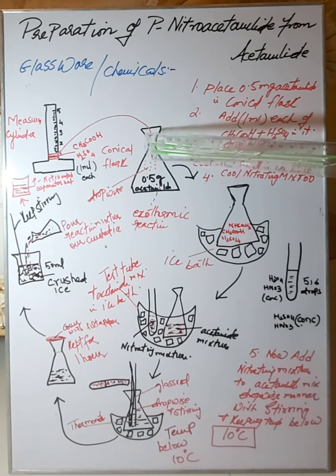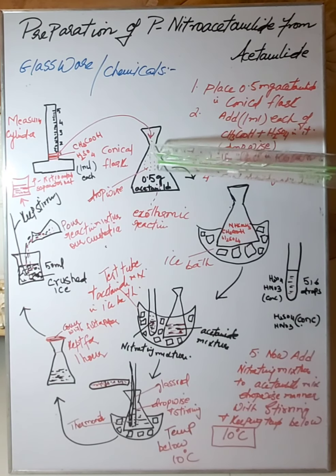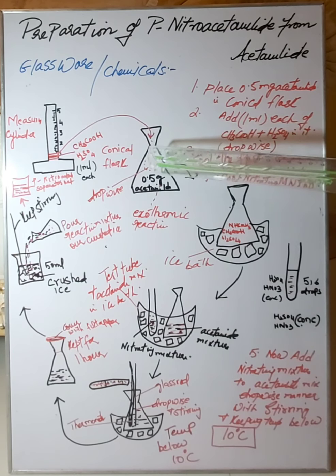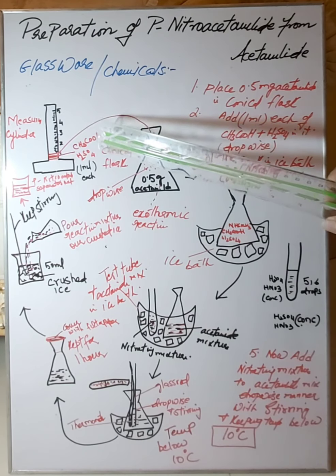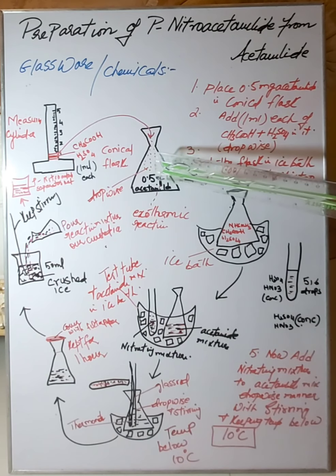You remember, whenever you are progressing an organic reaction, you are supposed to be very slow. It's a quote also, slow and steady wins the race. So you have to be very slow when you add the compounds. Whenever any two organic compounds are added together, they are supposed to be added very slowly, and the reaction is supposed to progress in a smooth and slow manner, right? In the same way, we are going to add this mixture of acids, acetic acid and sulfuric acid, in a dropwise manner in this flask that contains 0.5 gram of acetanilide.